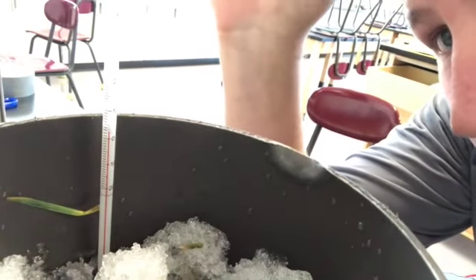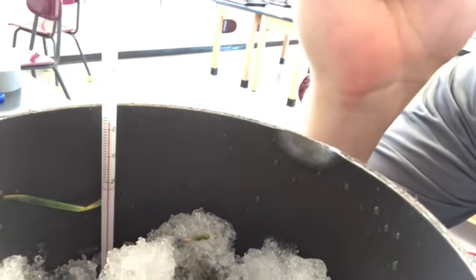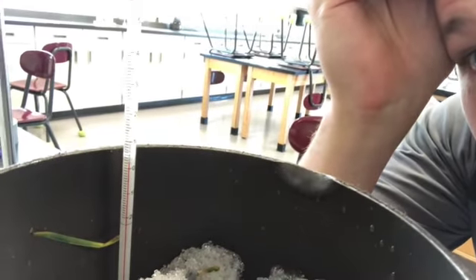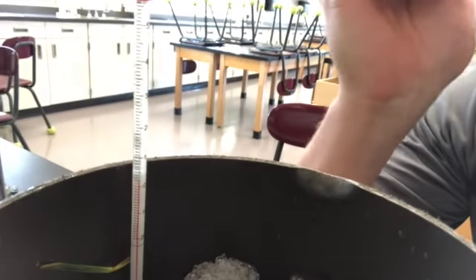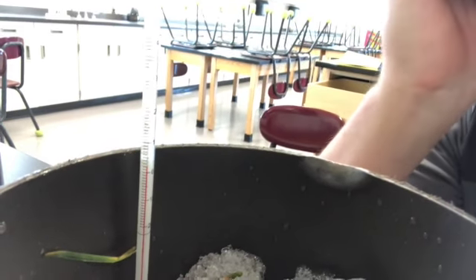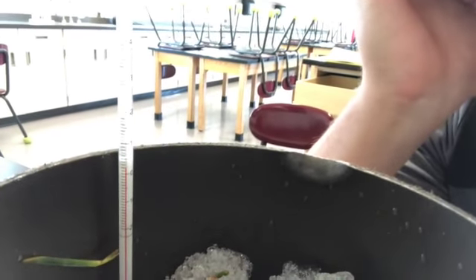Okay, so right now I have my thermometer in there at the beginning time, and I don't know if you can see it or not, but it looks like it's at about 2 degrees. All right, I'm going to set my timer for 5 minutes, and then I'm going to come back and we're going to see what that temperature is. I want you guys to make a prediction in your head. What do you think that temperature is going to be after 5 minutes as it's sitting on my hot plate here?